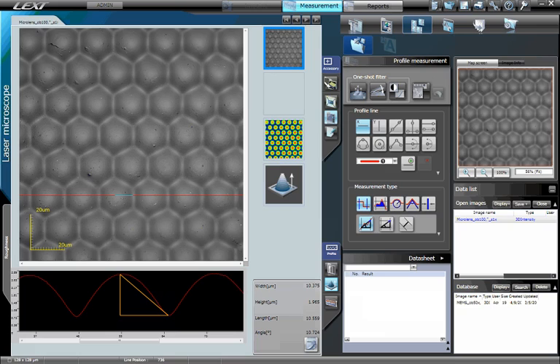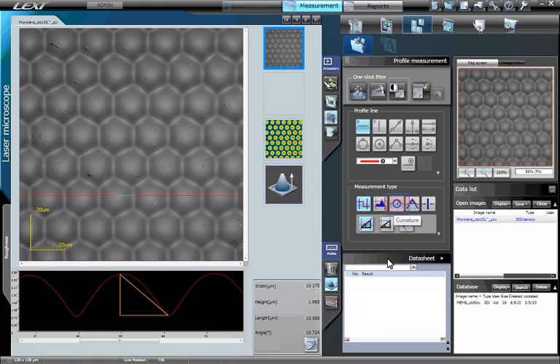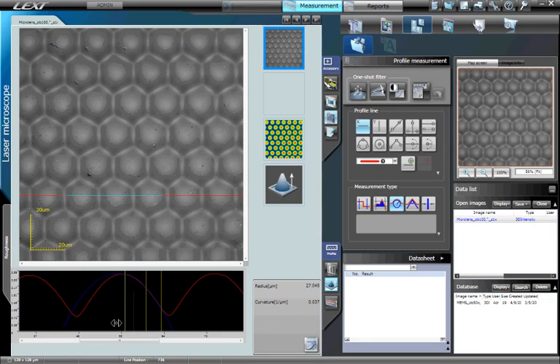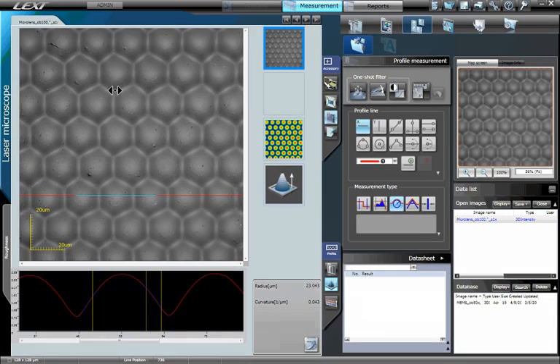Another popular style of line profile measurement is curvature. For example, here we will measure the curvature on the surface of this microlens. To measure the curvature of these features, simply select the curvature button as the measurement type. Position the three yellow vertical lines at equidistant points across the contour of the feature.